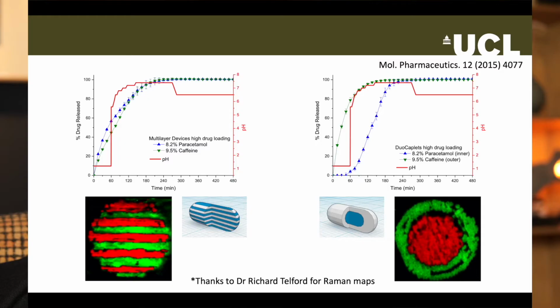shell. We tasked a research student with drug loading these printlets, and they chose to use caffeine and paracetamol as model drugs. I presume they were thinking of the ideal polypill for a student revising for an exam. Paracetamol to ward off the headache caused by stress, and caffeine to enable staying awake for the 24 hours prior to the exam. You know you do that.